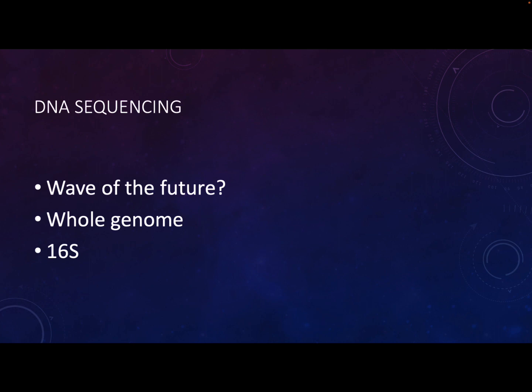But they actually make portable genome sequencers now that you can literally plug into the USB port of your computer and sequence in real time. So if you have a patient specimen, you can sequence it and identify it in real time. They used it in the Ebola outbreak, 2014 to 2016, to diagnose people with Ebola.